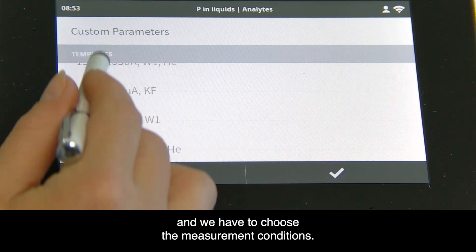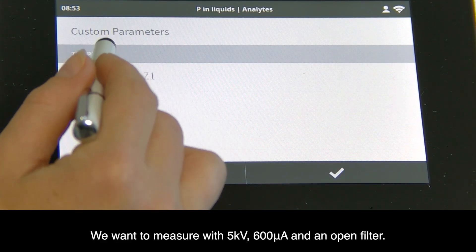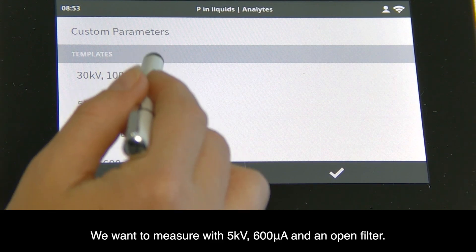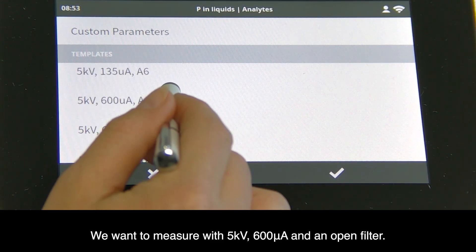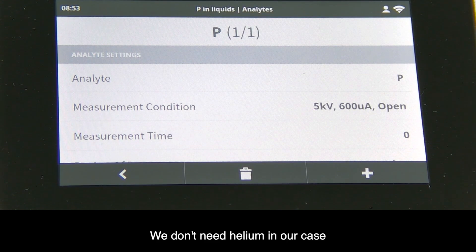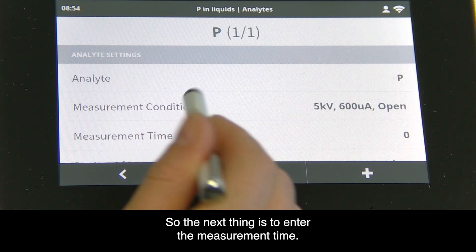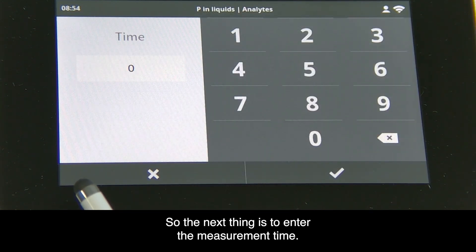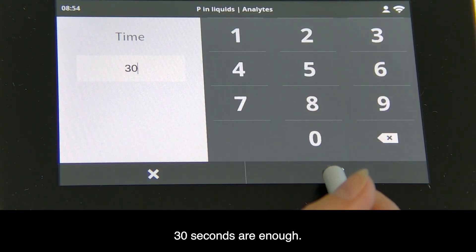We want to measure with 5kV, 600 microamps, and an open filter. We don't need helium because of the air density correction. Next we enter the measurement time - 30 seconds is enough.